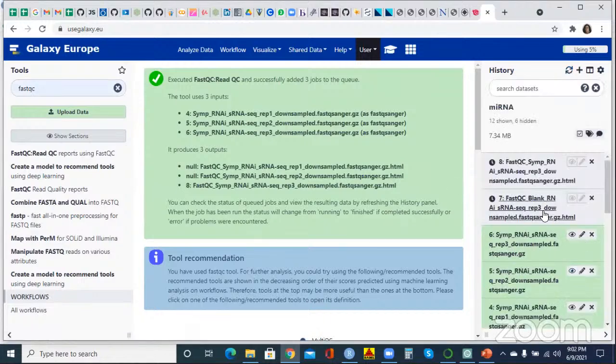So let this go to QC, and I hope that most of you know how to align this with the reference. Because we know the reference, it is an alignment with the reference. We can do anything, we can do HISAT2, we can use TopHat, any kind of alignment, and generate the BAM file. Once we have the BAM file, meanwhile I'll just show you some servers where you can do the analysis, and then we will go to R.